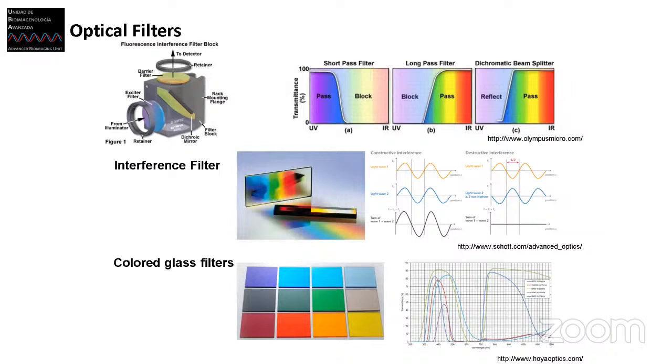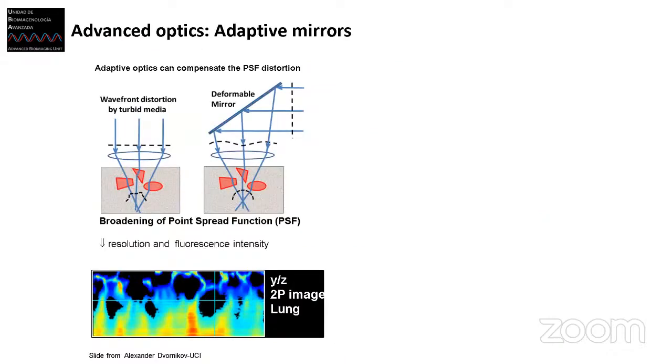And we will learn from Sasha that for the diver detector, glass filters that absorb light, which just transmit whatever is not absorbed, are the key element in order to do imaging in this microscope.